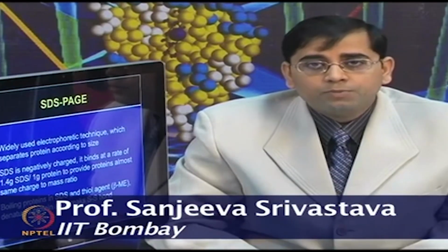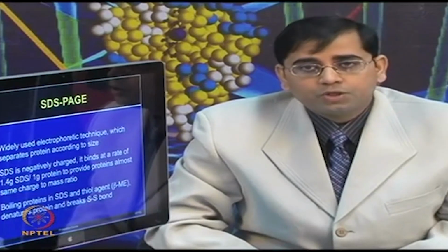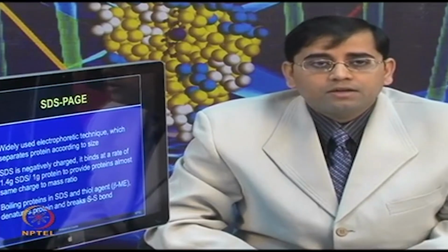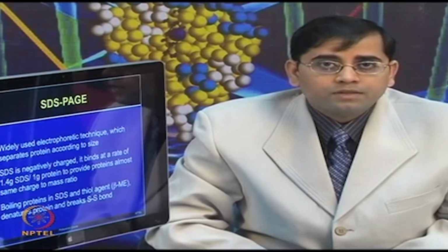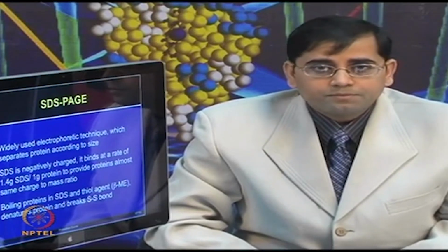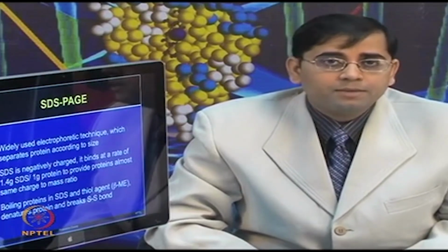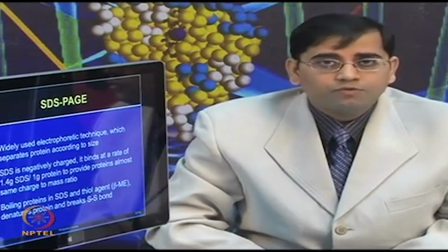As I mentioned, there are steps required to prepare your protein for denaturation. So, you need to boil your proteins in SDS and beta mercaptoethanol and DTT to denature the protein and to remove or break any disulfide bonds. Now, since you cannot do this boiling step in your two-dimensional electrophoresis, where you have already focused the IPG strip in the first dimension, you need to do the equilibration step. Rest of the steps will be very uniform.